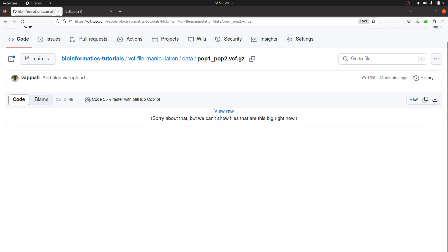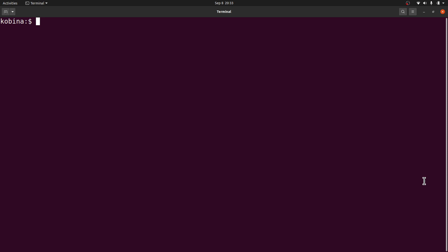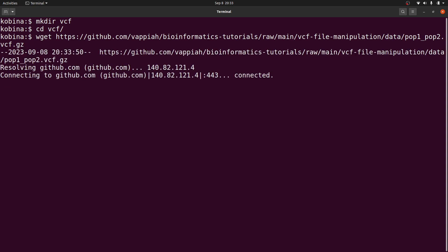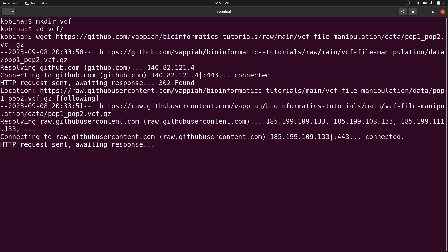I'll copy the link and move to the terminal to download. On the terminal I'm going to create a directory and cd into it — I like to keep files organized. I'll say mkdir vcf and then cd into it. I'm going to download the example data using wget and paste the link. On macOS you'd use curl. It's a small file so it will download quickly.